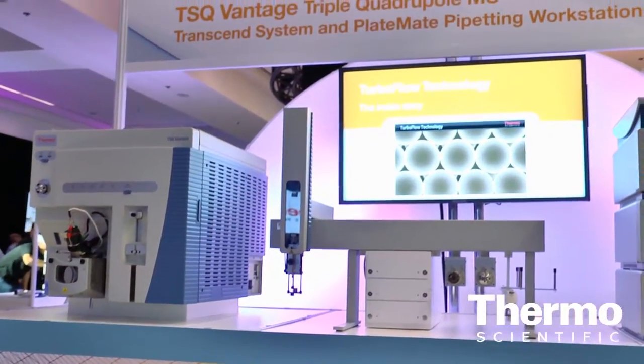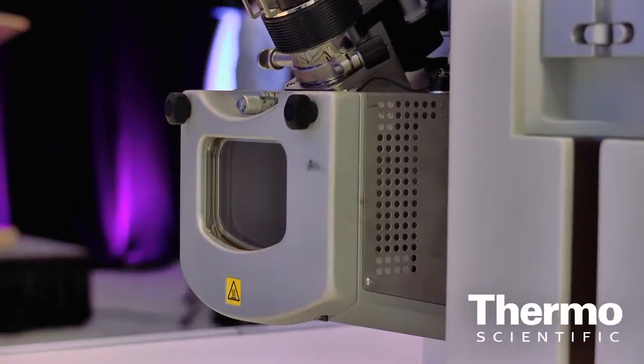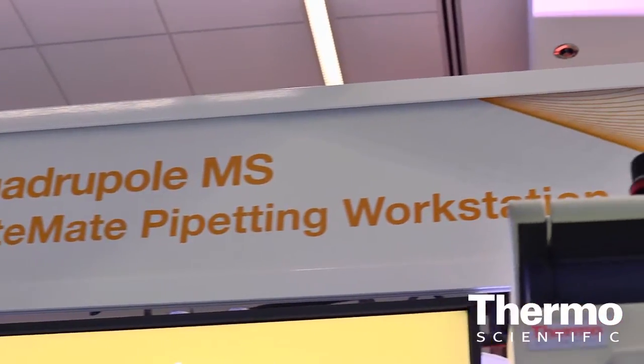With the Vantage, we've made some really unique instrumentation changes to it. We have an S lens on the front in order to get the highest level of sensitivity. We have the best performing hyperbolic quads on the market. We can do isolation widths as low as 0.1 AMU, which really helps the user be able to remove matrix from the analyte peaks.